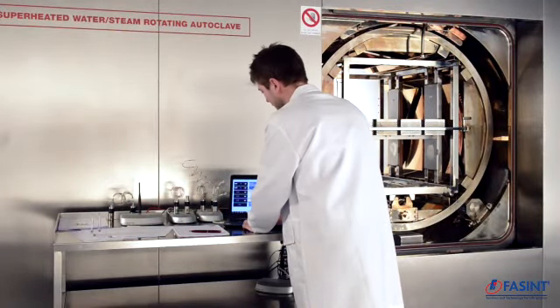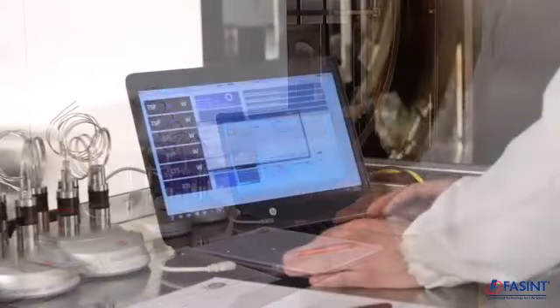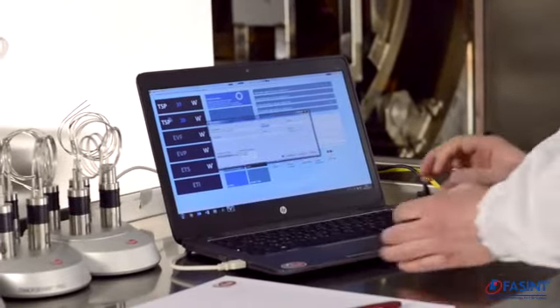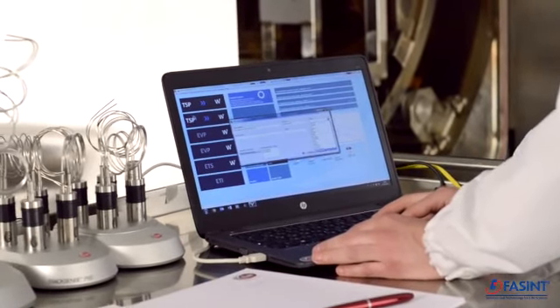Here you need to give a neat ID name for your session and select other parameters for your study, like process. In this case, it will be an superheated water process, F1W.